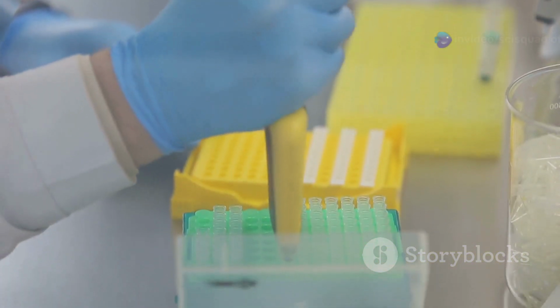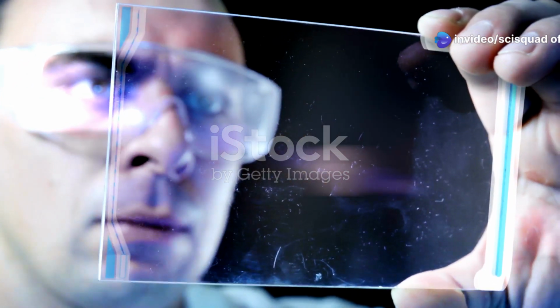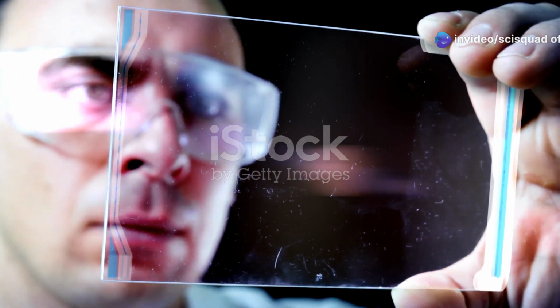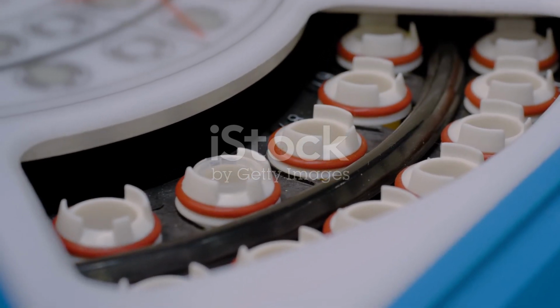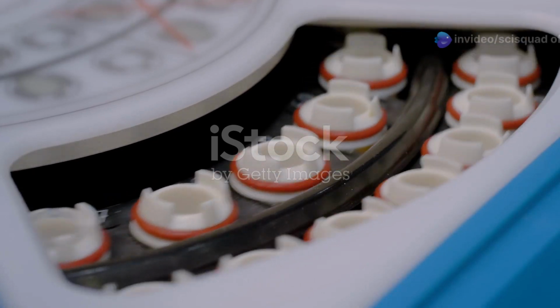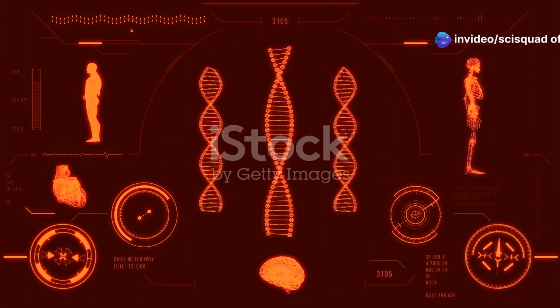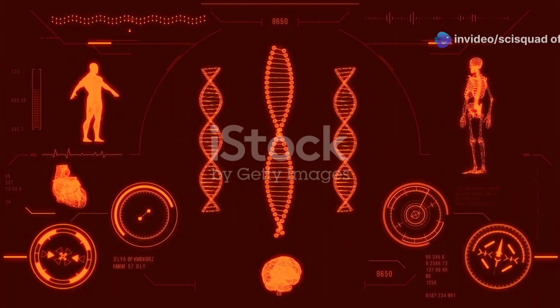Now that we have our collection of DNA fragments, each tagged with a fluorescent dye, it's time to bring them into the spotlight. This is where capillary electrophoresis comes into play, a technique that separates the fragments based on their size, much like a molecular racetrack. As these fragments race through the capillary, a laser illuminates them, causing the attached dyes to fluoresce.